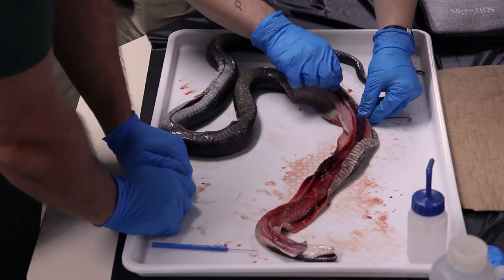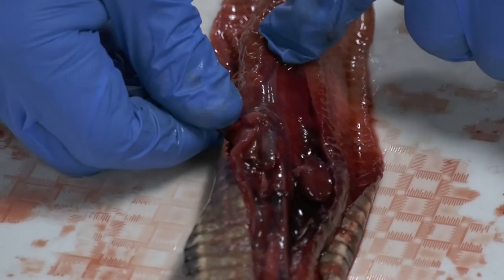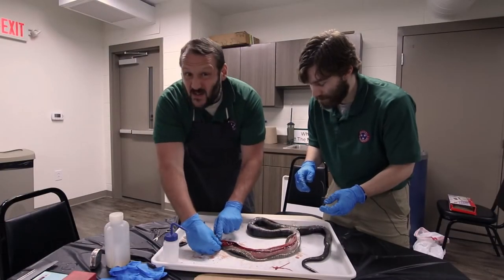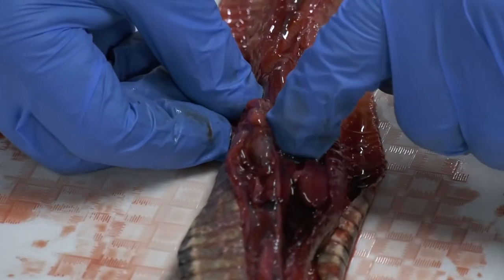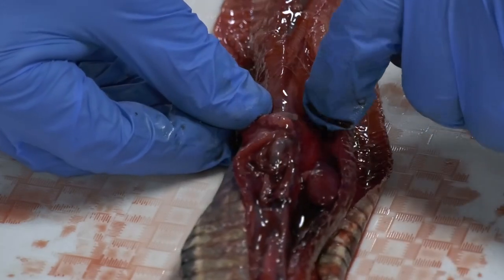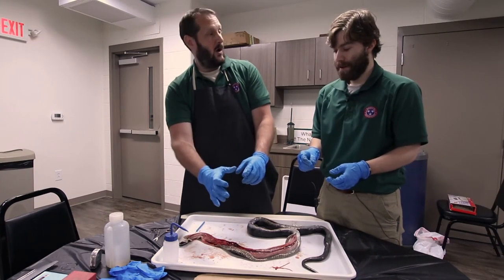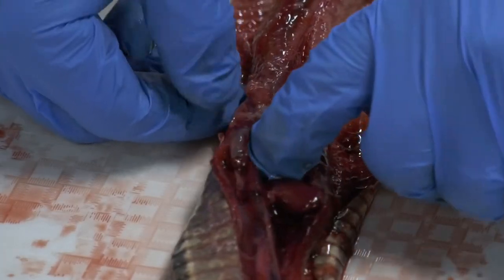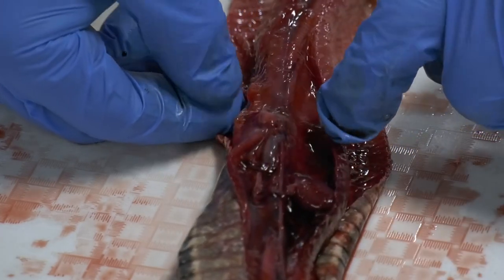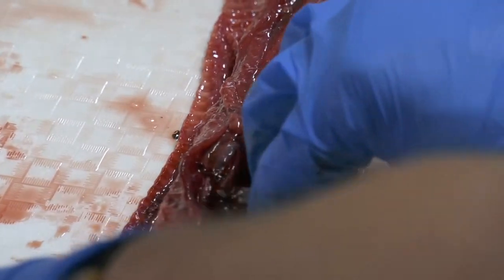So let's see. Before we get down there, this trachea should go to a lung, right? You notice I said lung, singular, because one of the space-saving adaptations that snakes have is that all snakes, or most snakes, only have a single functional lung. I think it's all snakes. Sometimes they can have a vestigial second lung. Of course, it's harder when the animal is deceased. Oftentimes those lungs deflate, so they're tricky to find.